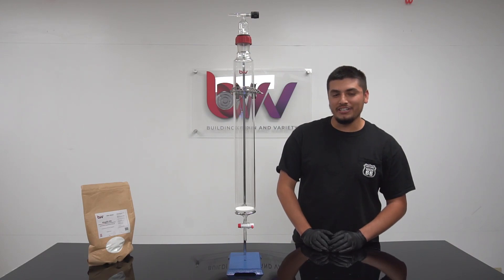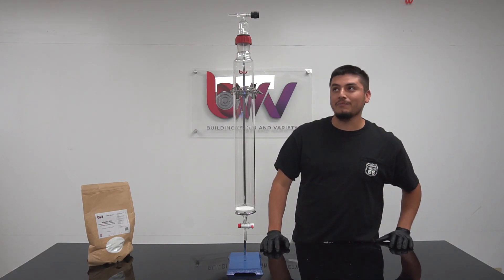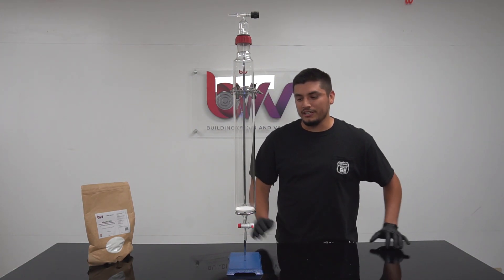Hi, I'm an engineer here at BBV. Today I'm going to be presenting to you our 3 by 24 inch chromatography column. As you can see, this is what comes with the kit.